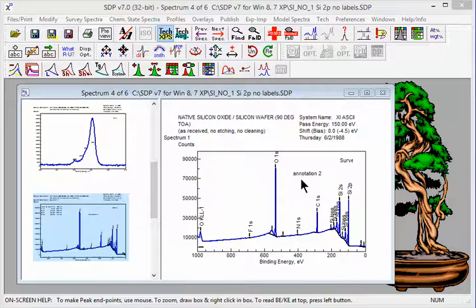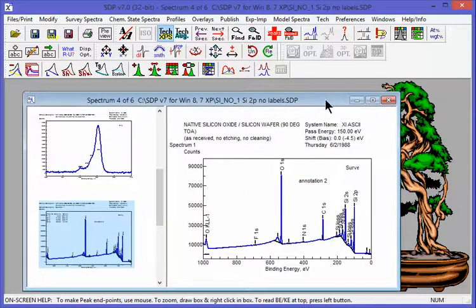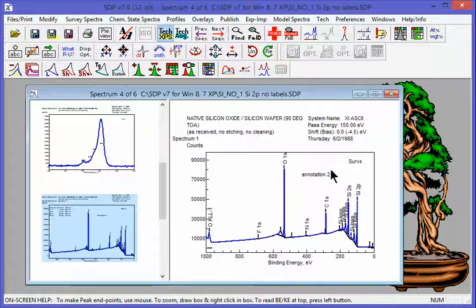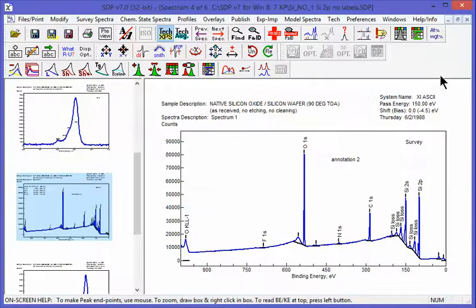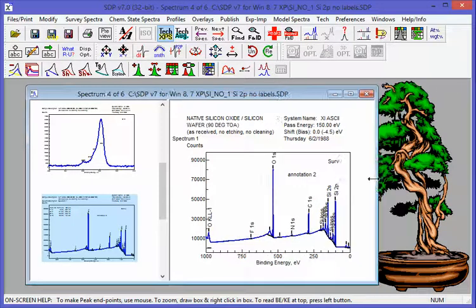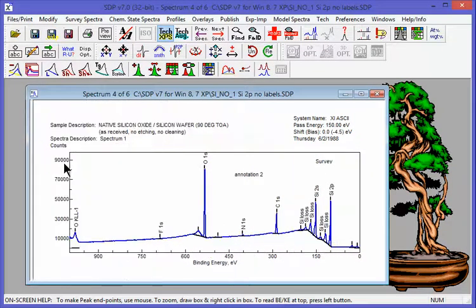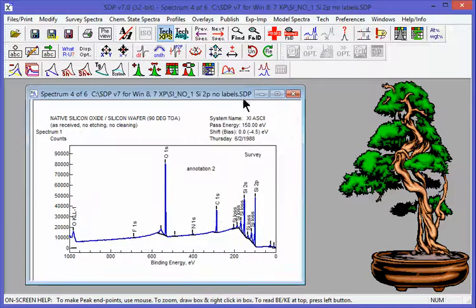In this lesson, we will be focusing on the main display features. As you can see here on the screen, we have a data file screen open. If we want to maximize it, we can do so. If we want to change its size or anything like that, we can do so. Of course, we can hide this over here as we please. And for now, I'm going to hide that.